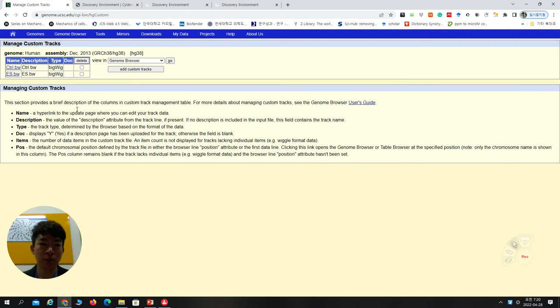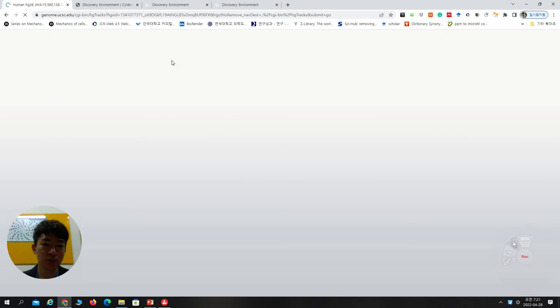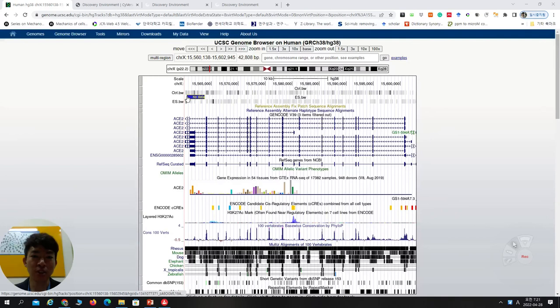After submitting, it shows BigWig files — meaning the system recognizes the byte-range request properly. If you want to delete it, you can, or you can display them. Most of the time, use the Genome Browser option and click 'Go.' If you want to add another custom track, you can do it again. Now this is your data — only two tracks from your files. The other tracks are all from public sources.